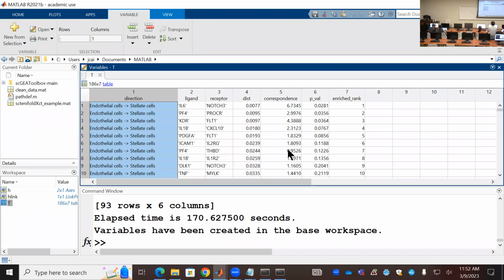To put it into a network. Oh, you see a network, and yeah, we have to find a way to plot the network. It's hard. Once you have a large number of genes, how can you draw the network? It's a big problem.